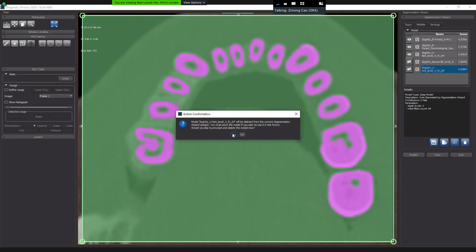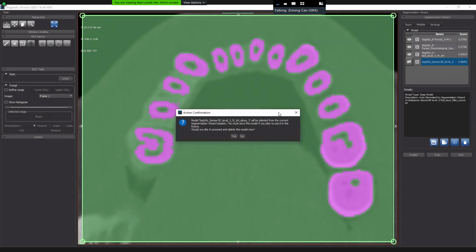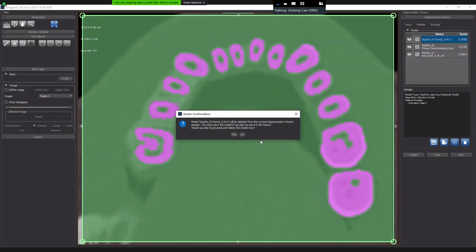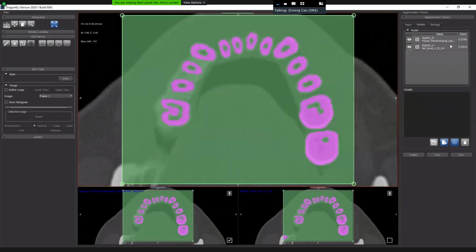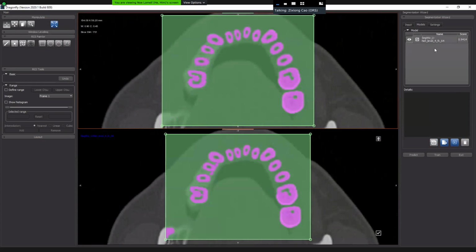How to choose the best model and how to train it to the best performance, that's some advanced topics too. We could talk about that next time. But today we only go through the workflow, so we don't say too much about that. We keep only the U-Net level 4 that we created, then we do the training again.